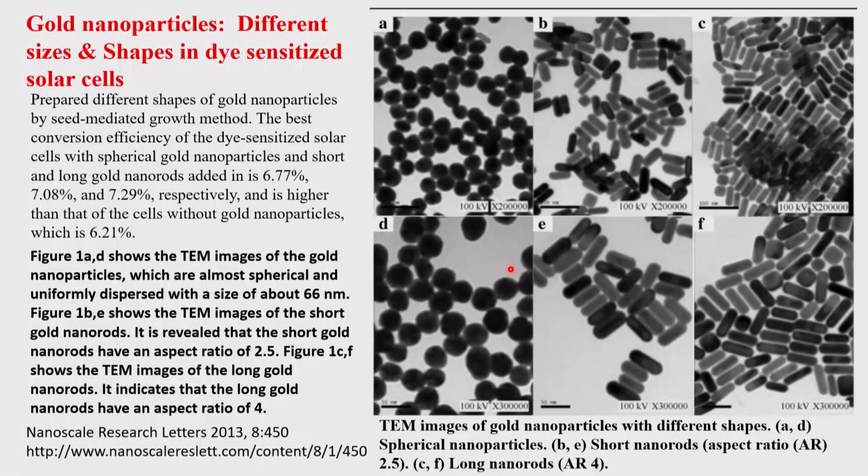Let me draw your attention to this first example in this particular transmission electron microscopy thing that we have. See, the literature is full of examples, so obviously one cannot cover even 1 billionth part of that. So obviously I have taken a few representative examples of the recent origin and then try to present to you.